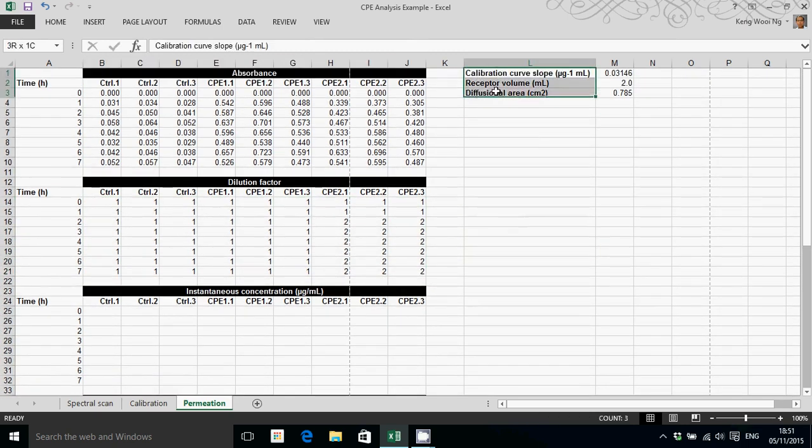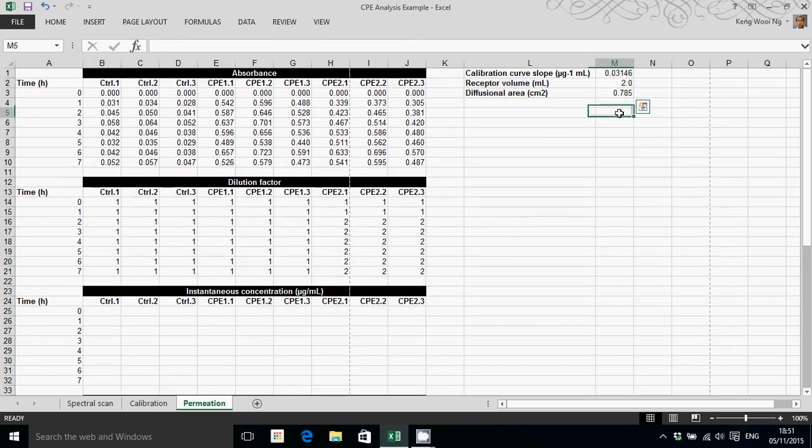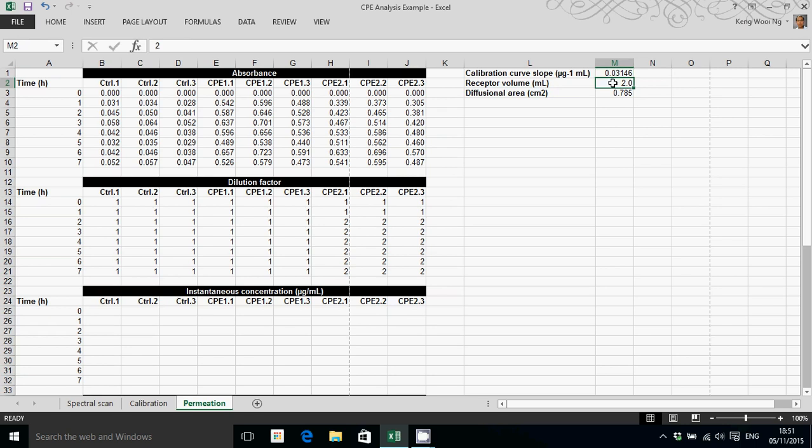Now on this side of the spreadsheet, I have information regarding the calibration curve slope, and the volume of the fluid in the Franz diffusion cell, and the diffusion surface area of the skin.